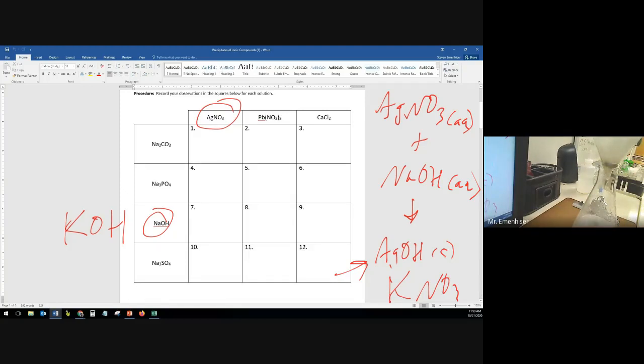Ooh. And I want to see that solid. Let it dry. And if I didn't want to wait, I could heat the solid and drive off the water. I could heat the water and get it all gone. But I don't want to. But we'll just wait. So that's not number two. What was that? Number 7.